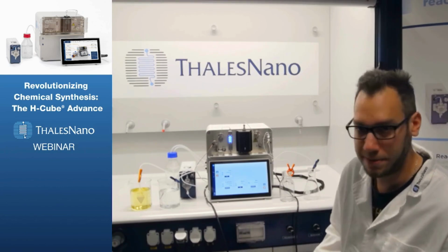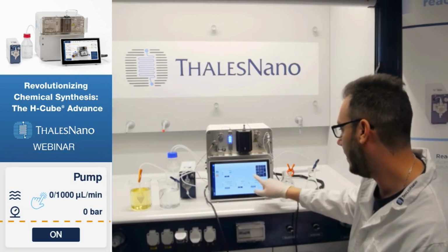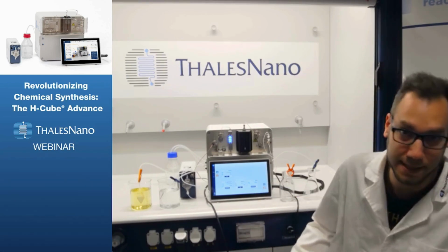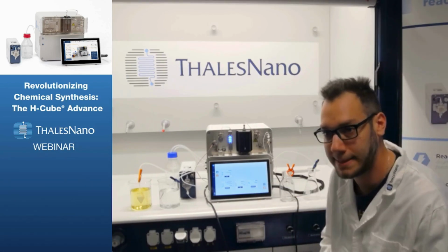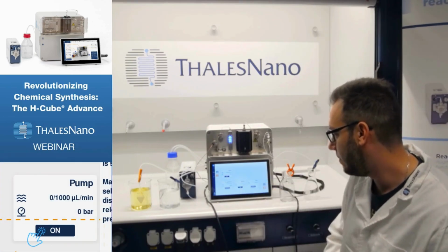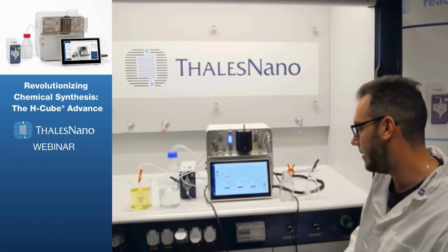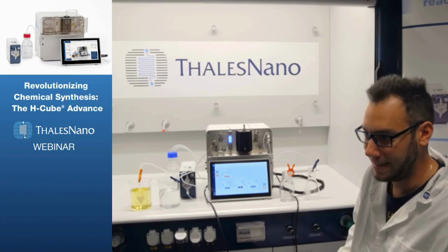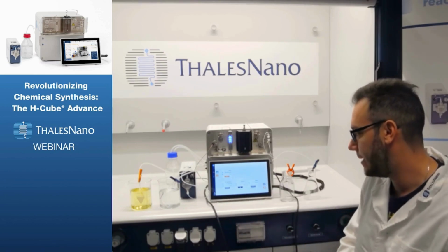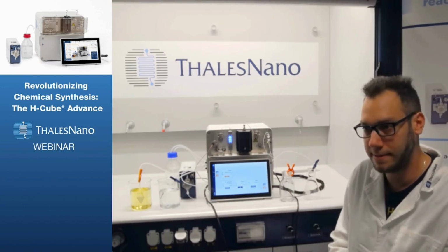In order to do that, the first thing I'm going to do is click on the pump window and put in 1000 microliters per minute, which is 1 milliliter per minute, the most common setting for a system of this size. I'm just going to press the on button, and you can immediately see a dotted line moving around. It's an animation that indicates it's pumping the liquid through the clean solvent flask.